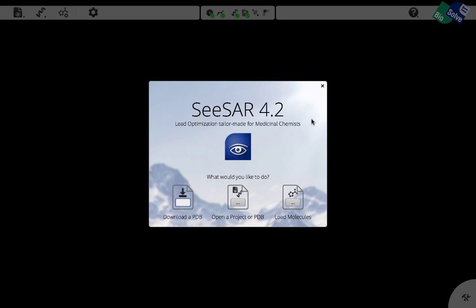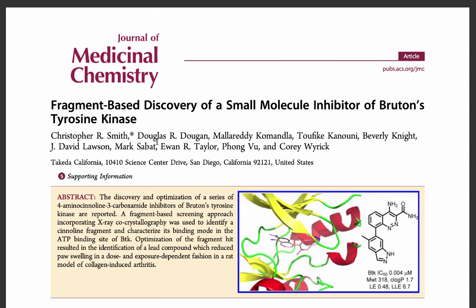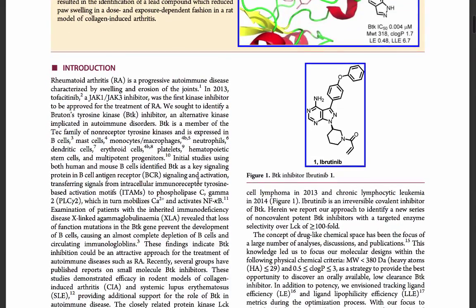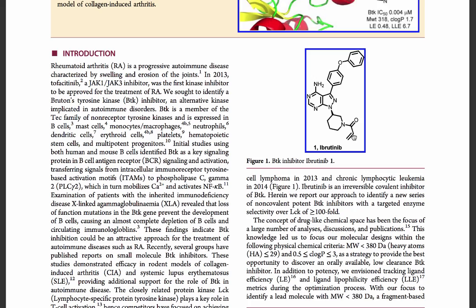We would like to orient ourselves by using an example that was published by Takeda, fragment-based discovery of a small molecule inhibitor of Bruton's tyrosine kinase. They wanted to come up with an improved version of an inhibitor because the most prominent one, Ibrutinib, is quite large and is also binding covalently against the protein.